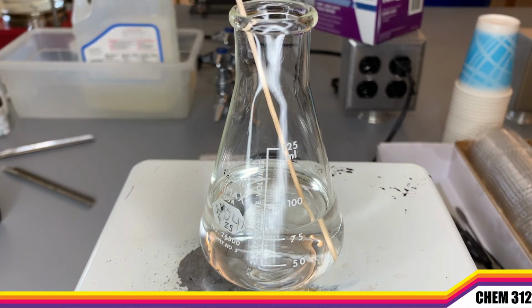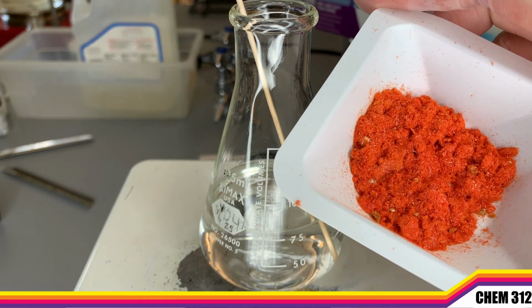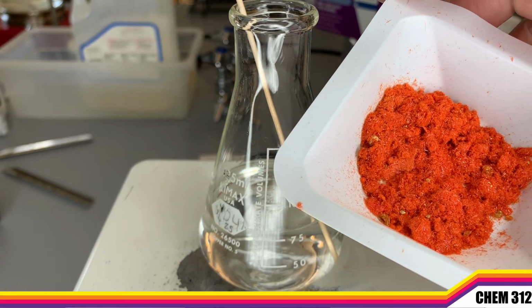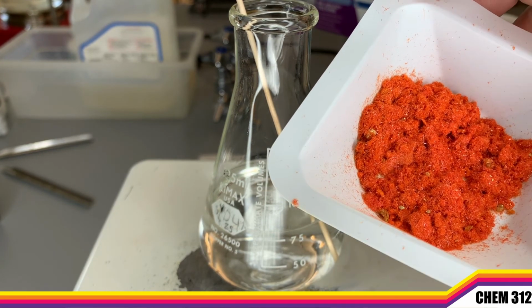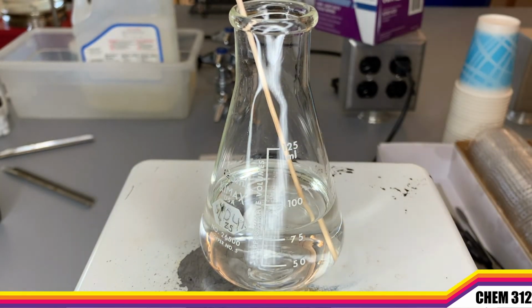Our imine product can actually be purified by recrystallization. As things cool down in our flask, sometimes they can trap some impurities, including some of our starting materials. So I'm going to repurify some of this using a recrystallization. I have 978 milligrams, or 0.978 grams, of our imine product here that needs to get recrystallized. This is from an old batch of this synthesis, so this is not from today. That's why you can see there are little flecks of brown in it. I want to get this nice and cleaned up for our use.